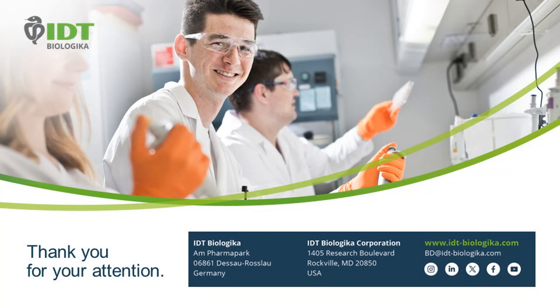And also, to save time and effort, we are able to perform these studies under non-GMP conditions. Therefore, we have established different systems allowing us to generate a really high number of data within a short time frame, so high throughput technologies at the end, and to increase the success of these additional redeveloped packages. This is also possible in combination with our established fast-track analysis, allowing us to evaluate these data also in a short time frame with these high throughput technologies.